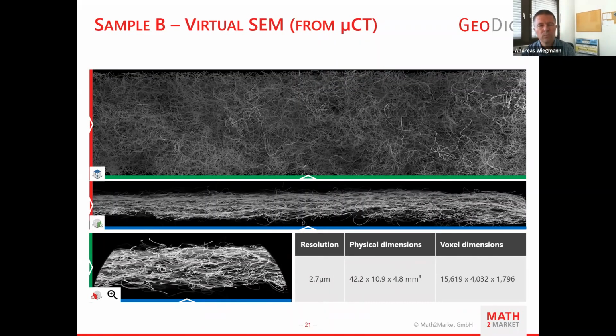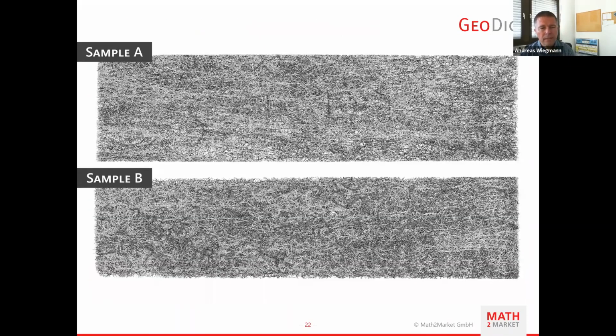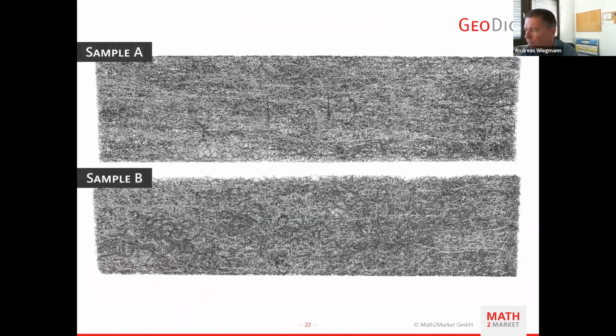You can see why one would want to do this. You have 2 different types of materials, and you really want to see after analysis what is different about them. Not just porosity, which you might still get with other techniques, but fiber lengths, fiber orientations, fiber curl, etc., all of that. So we have here a visualization of these 3D scans.